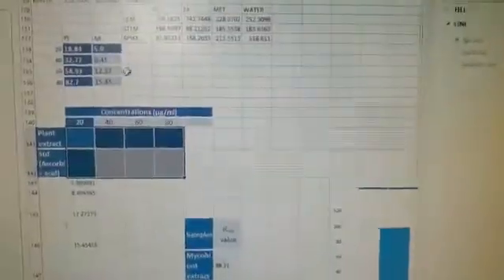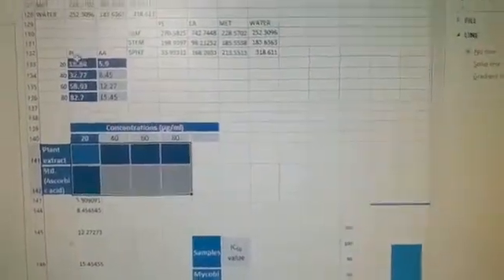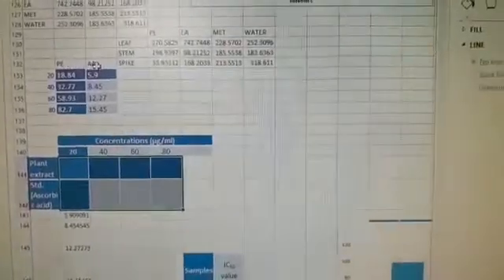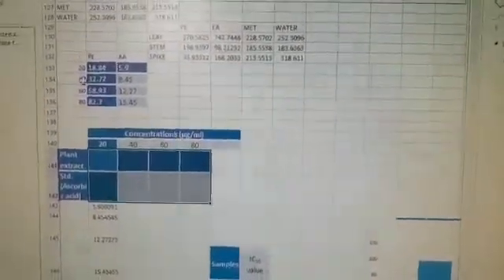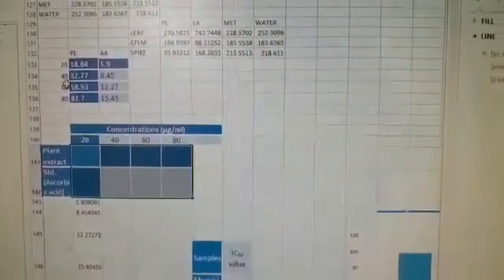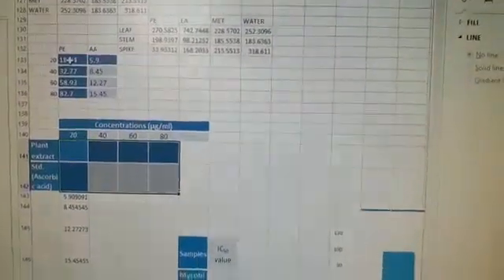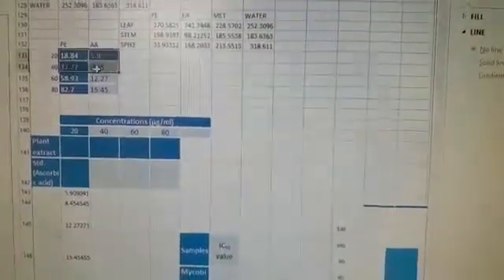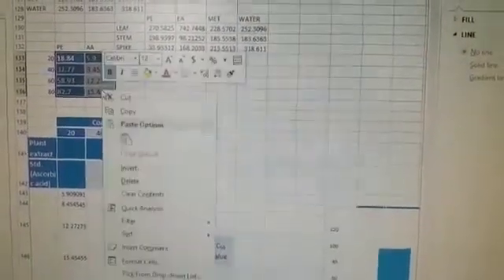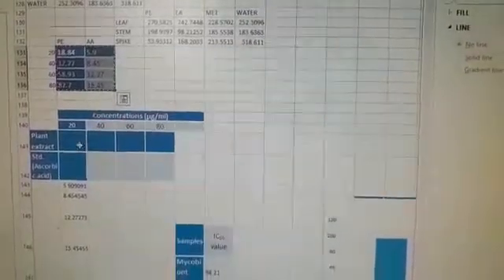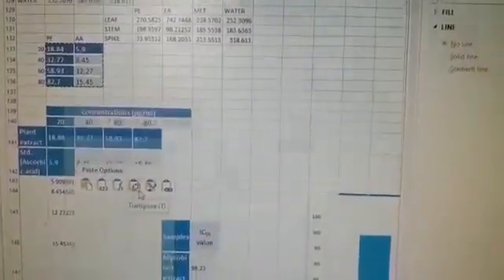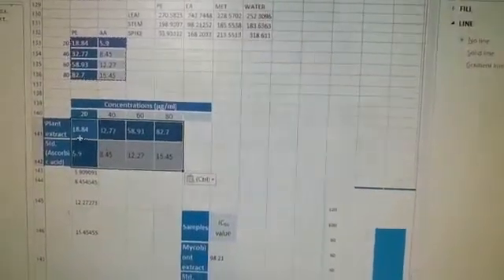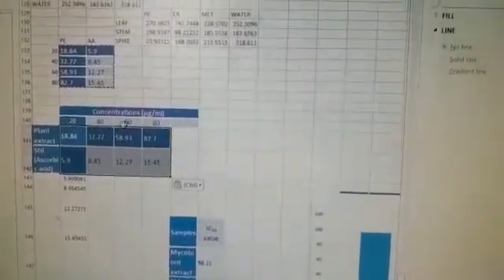Here you see the values of P, which means plant extract, and AA, which means ascorbic acid. These are the concentrations: 20, 40, 60, 80. Select all these values, copy them, and paste here.